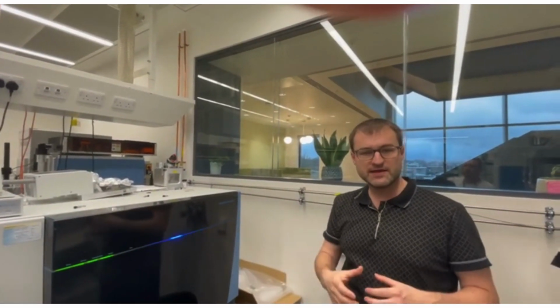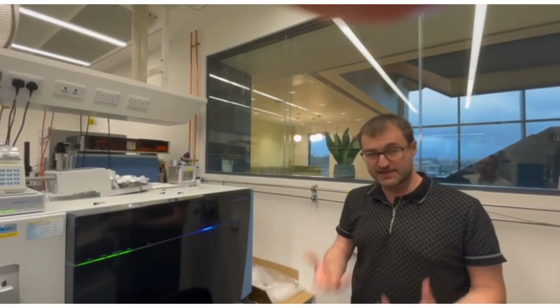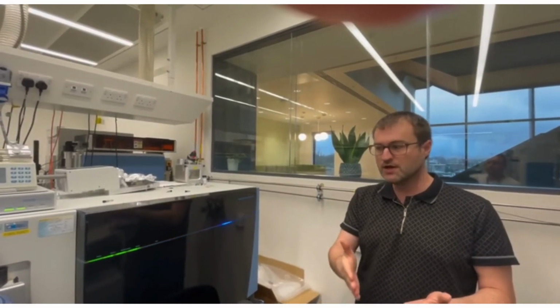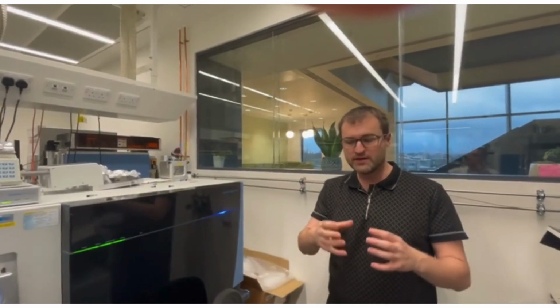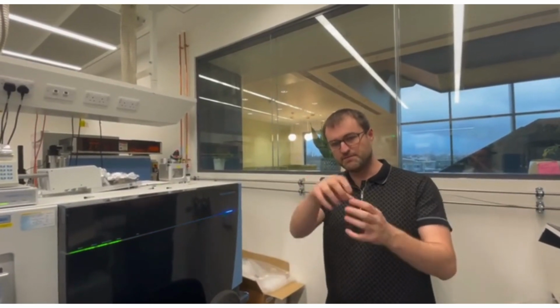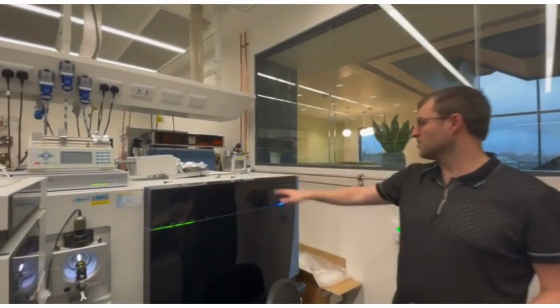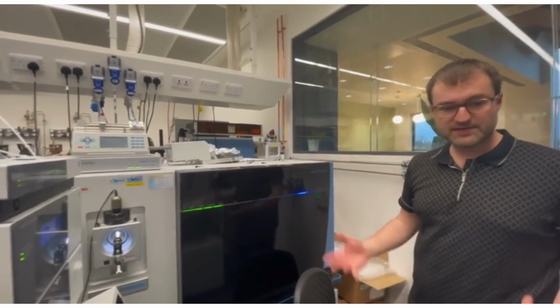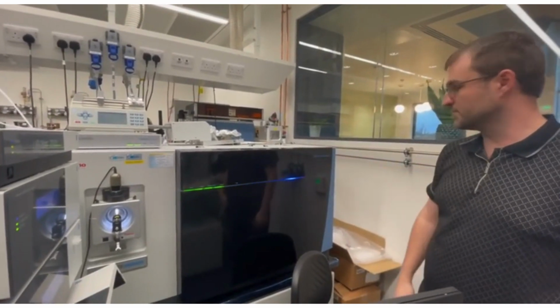So you can get more and more levels of selectivity with this multi-fragmentation. Imagine how selective things are when you can isolate one of the analytes, fragment it, pick a fragment, fragment it again, and so on. This is the Orbitrap Fusion Lumos. Again, it's a fantastic mass spectrometer, even though it's a little bit on the older side now.